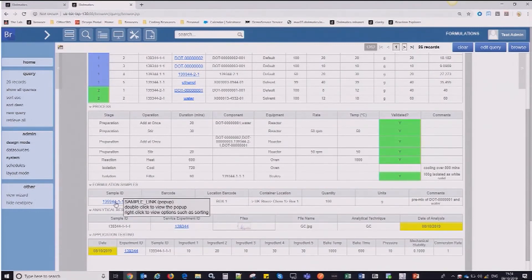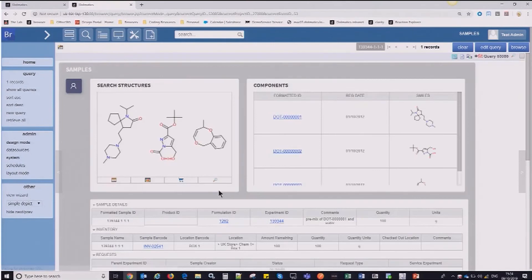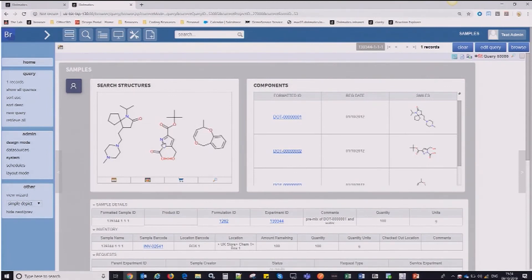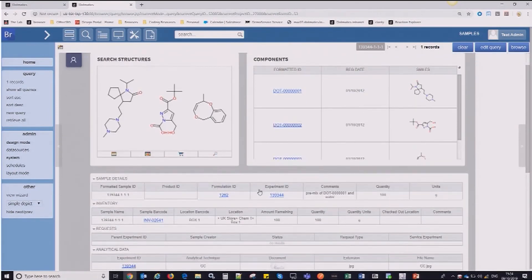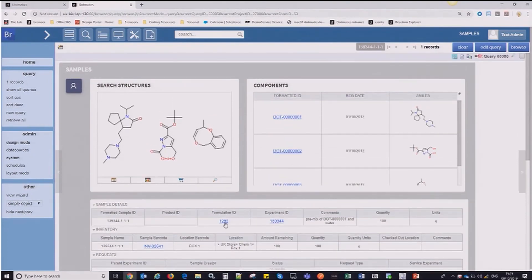It's really nice to show the sample ID project. For those of you that are interested in structural information, it's a really nice representation of showing all of the components or ingredients from your formulation in one place. This is also substructure searchable, so if you are interested in similar formulations, this can all be searched very easily. And then you've got the appropriate data that's collected at the sample level as well.